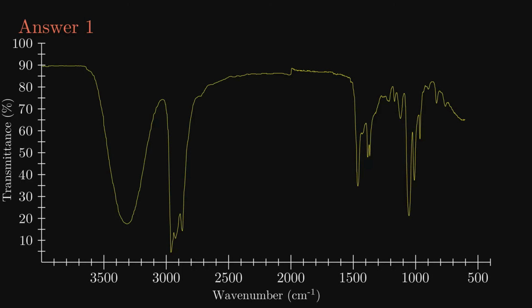Coming off of all the IR analysis we have done recently, you definitely pin down this peak on the far left as that of an alcohol. The peaks next door indicate a lot of hydrogens bonded to sp3 carbons. This gets confirmed around 1500 with the sp3 bending peaks and with the CH3 methyl peak next to it. We find around 1050 the carbon-oxygen single bond peak. What we can be sure of now is there is an alcohol on an alkane because there is no evidence of sp or sp2 carbons.